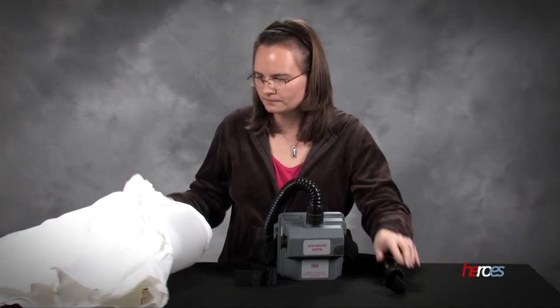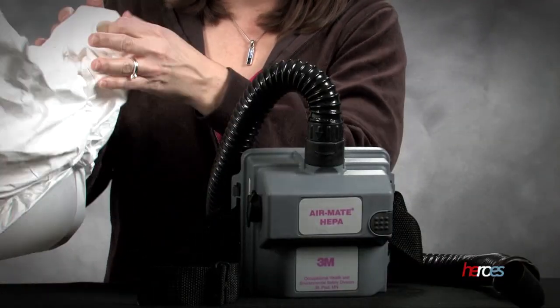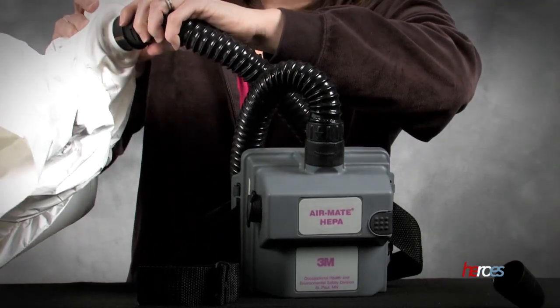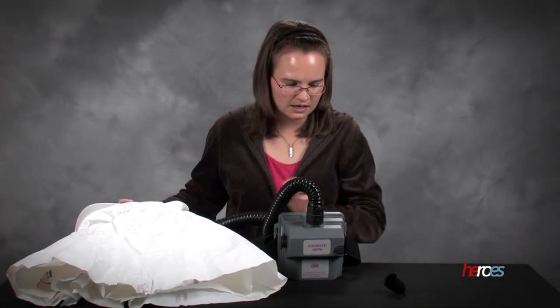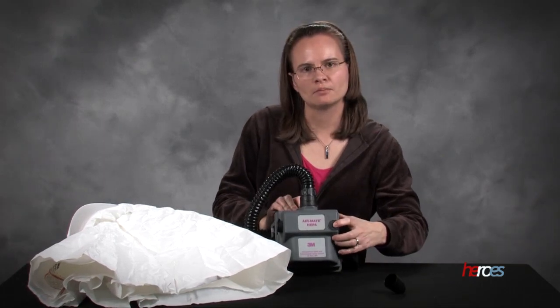Then we look at our hood here. There is a small area where the tubing can go ahead and connect to the back. We'll just push that in there until you hear a snap and then we're connected. So now we're ready to put that entire setup onto the person that's going to wear the PAPR.